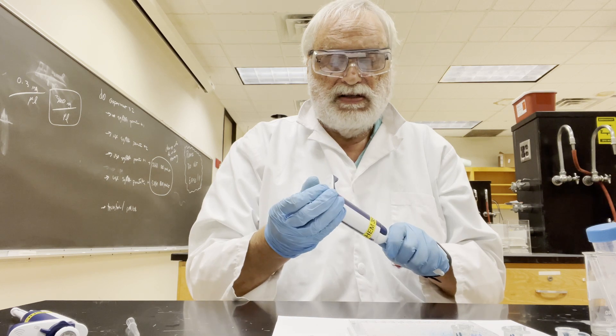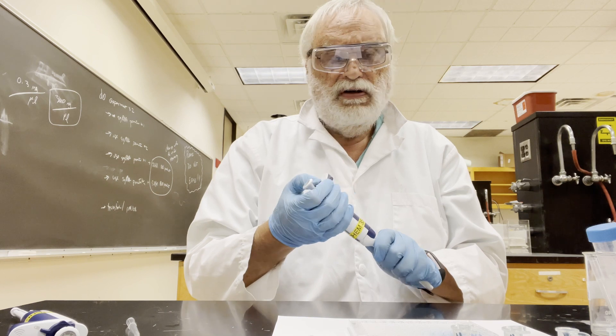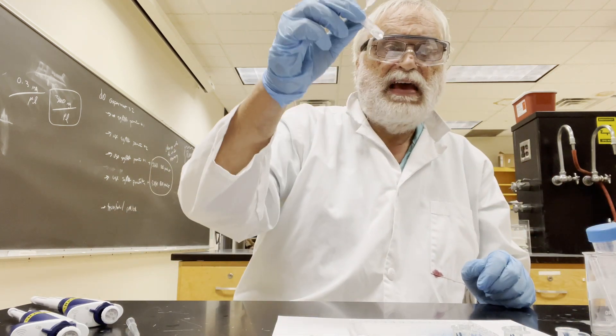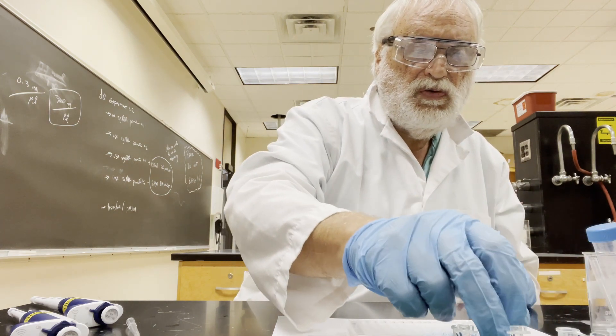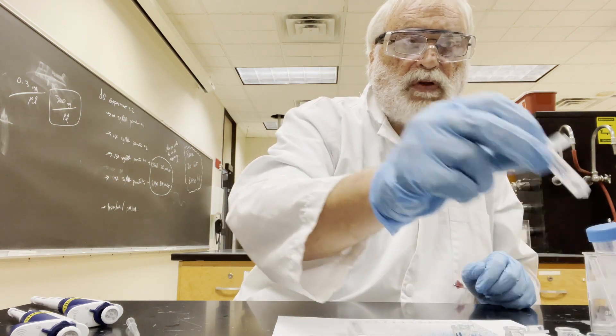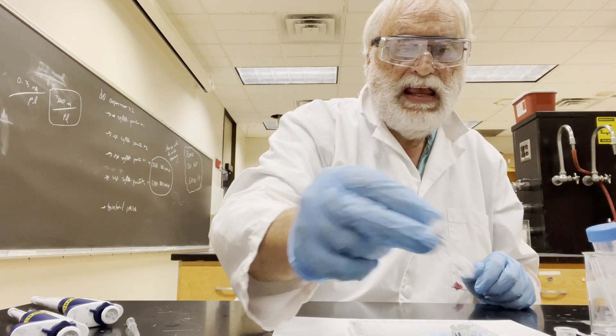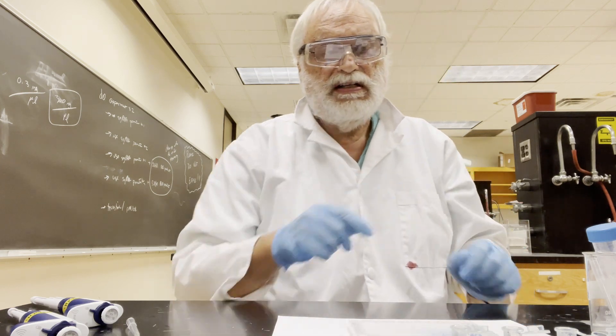What I did prior is I've gone ahead and added a half a milliliter in each one of these tubes. I have labeled them one-half, one-fourth, one-eighth, and one-sixteenth. So I have these already set up.